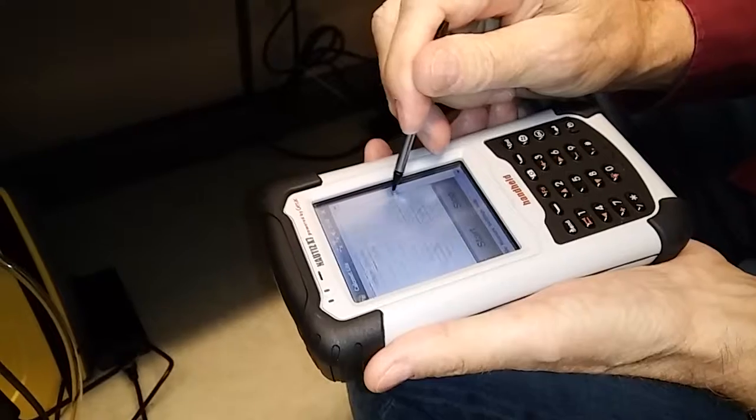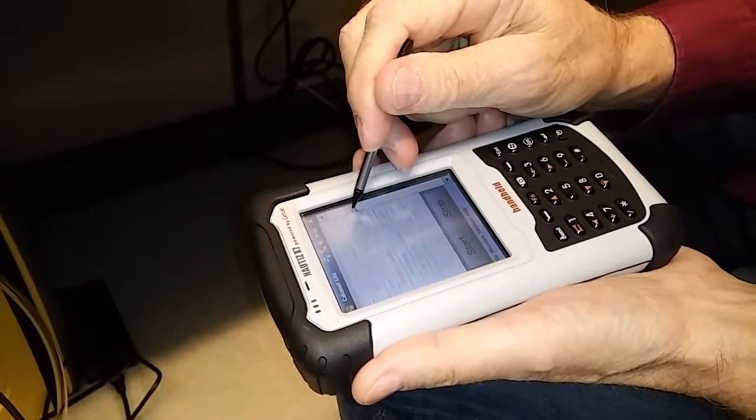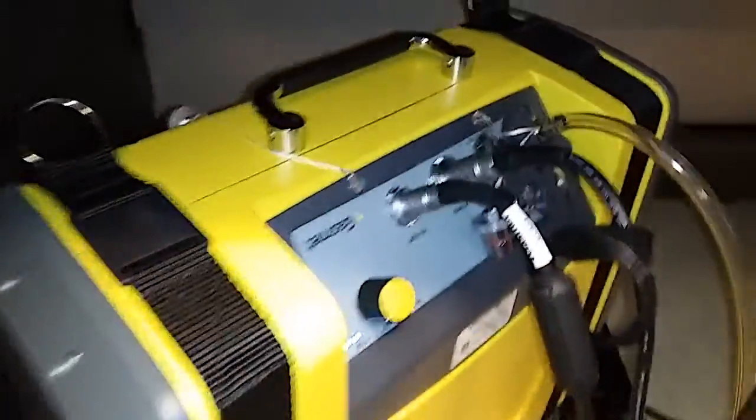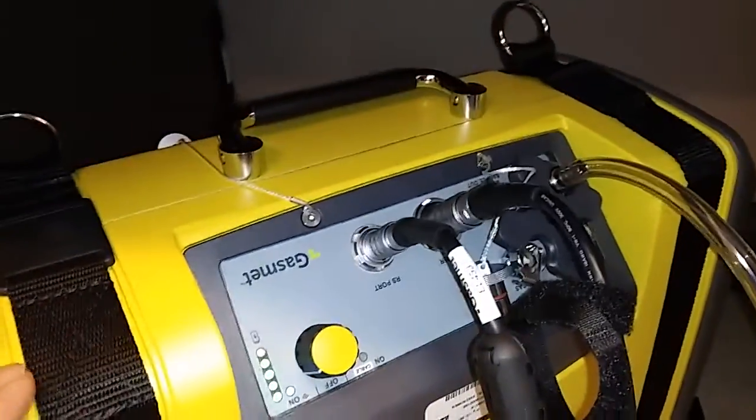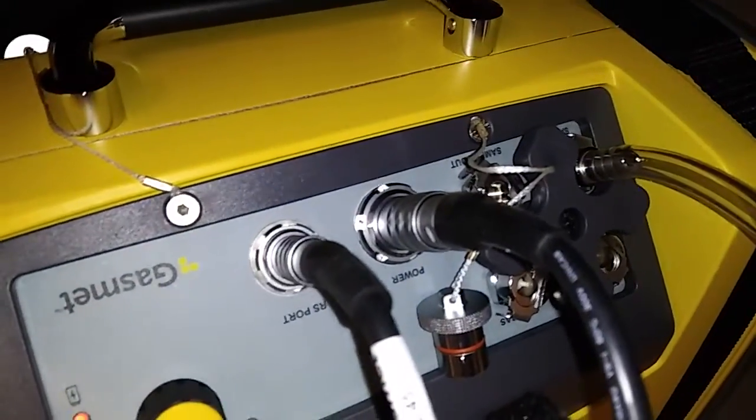How about humidity and nitrogen gas? No, it doesn't measure humidity. It measures water vapor. I'm sorry, water vapor, at the top, and that's zero basically. Carbon dioxide is basically zero. Okay, so we took one measurement.